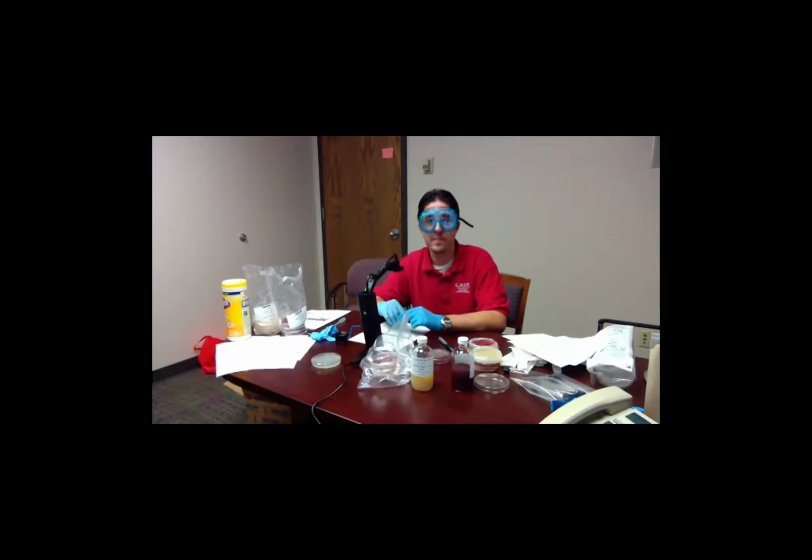They did a good job going through all that. Well, I hope I can pull that off. You know, I really can't stress, you can order the Carolina kit. It lays it out perfectly, detailed explanations. And I didn't talk about it, but it talks about what happens if too many bacteria grow, what is a bacteria lawn, when all you see is like a solid ice skating rink of bacteria, basically. Because that could happen when you plate these in your classroom, but you can't count that, so you just got to get rid of it.